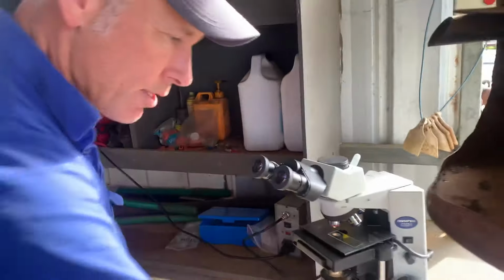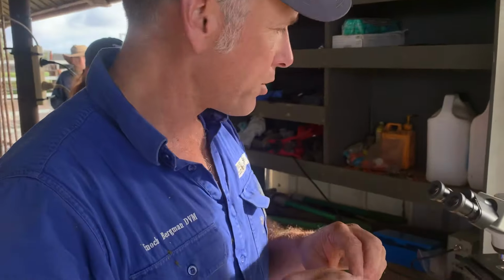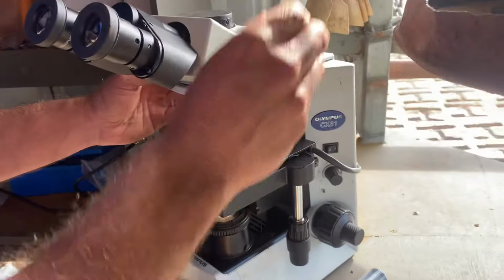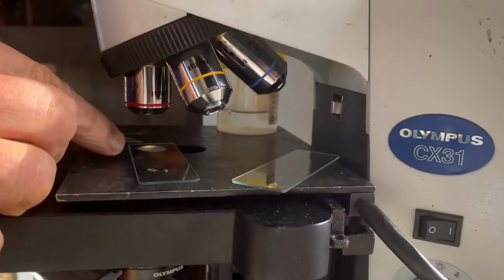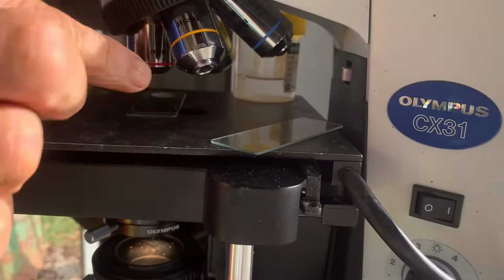He's got a mass activity of 5 with a concentration of 5. So we know he's going to have a good motility. I'm going to do his motility first, and to pass him he needs to be over 30, but I'm guessing he'll be around 60 or 70, but we'll check. Then we've got our lovely little cover slip. I don't know who makes these tiny little things. I think little elves. I've got my drop of warm saline here. I'm just going to get a tiny bit of semen from what I just looked at, stir it into that saline and drop it. This is going to allow me to look at the sperm individually.